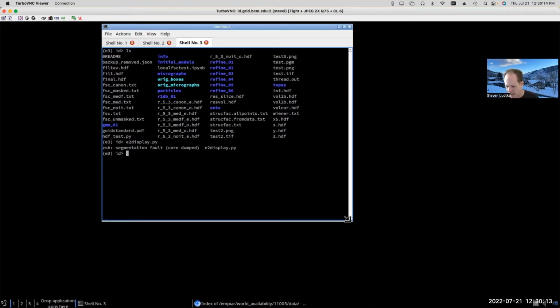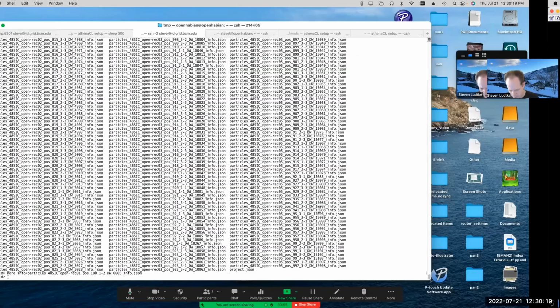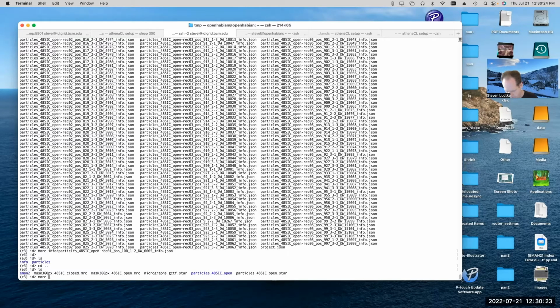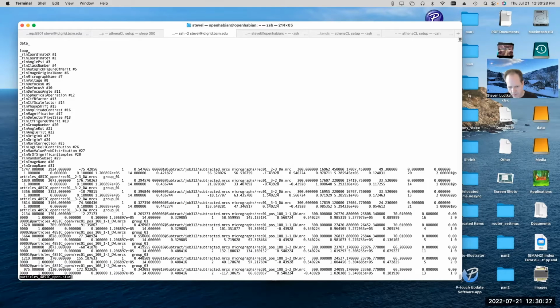Similar to the star files. Let's take a look at the star file again really quickly. The issue with the star file is while each line in the file contains the same number of parameters, the line lengths are all over the place.